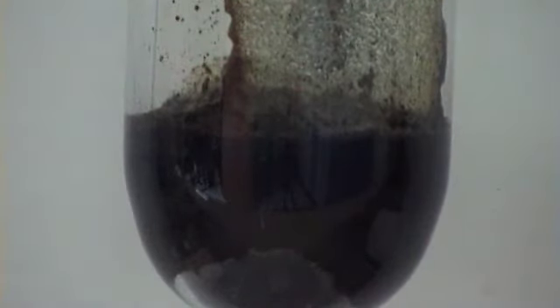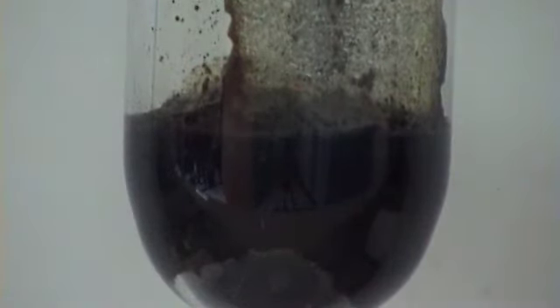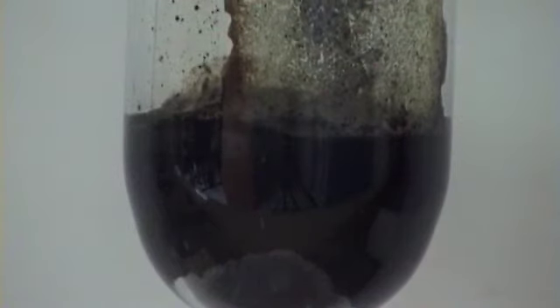Now, what happens is the reaction in here is producing a green colour. Apart from the anti-gravity matter in there, you can see a green colour in the background. That's the chlorine gas. The chlorine gas reacts with the iodide ions, another redox reaction, to make iodine and chloride. It's the iodine with the starch.